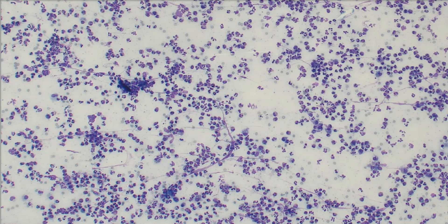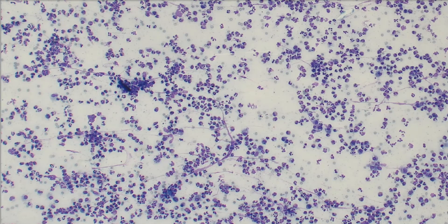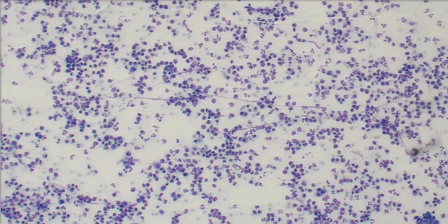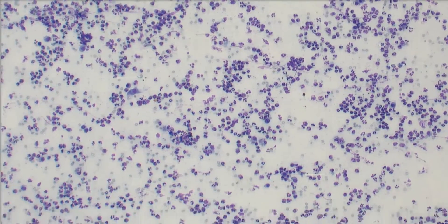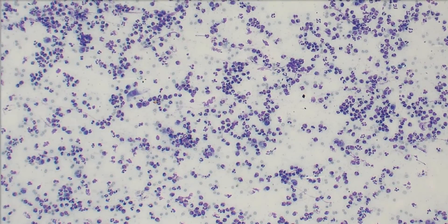I'm looking at this on 10x, and you can see that there are a lot of cells in here, which is great. We always want cells to look at on cytology. I'm going to scroll pretty slowly here just to show you how cellular it is — really nice cellular sample.